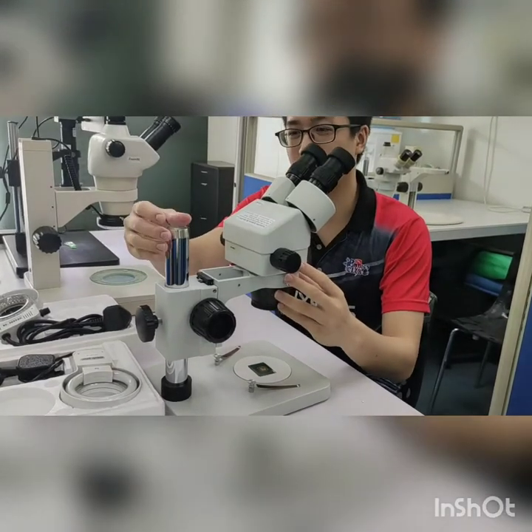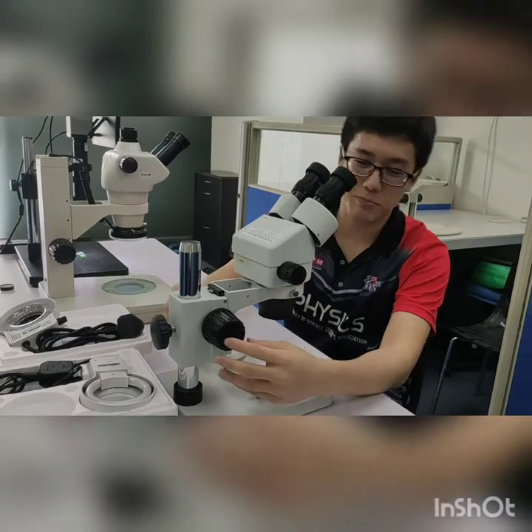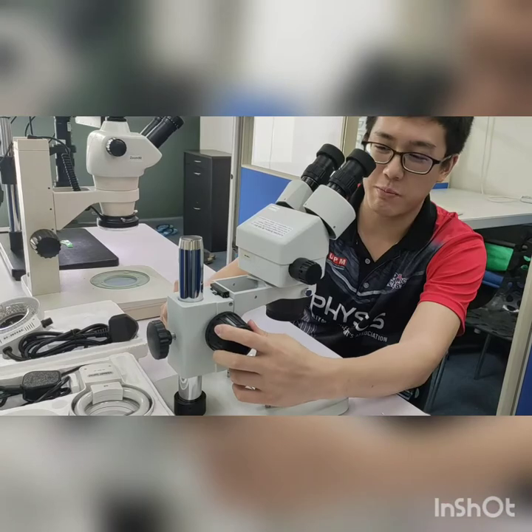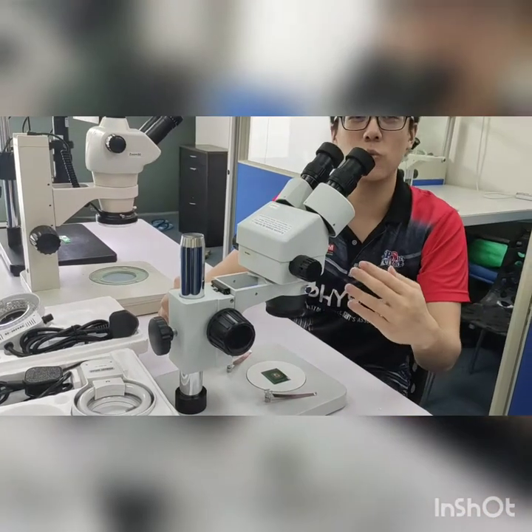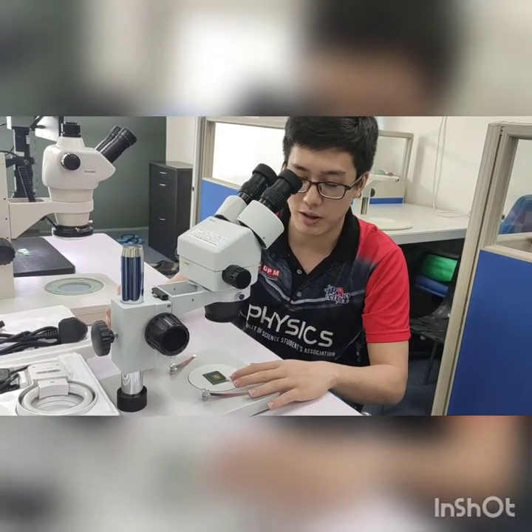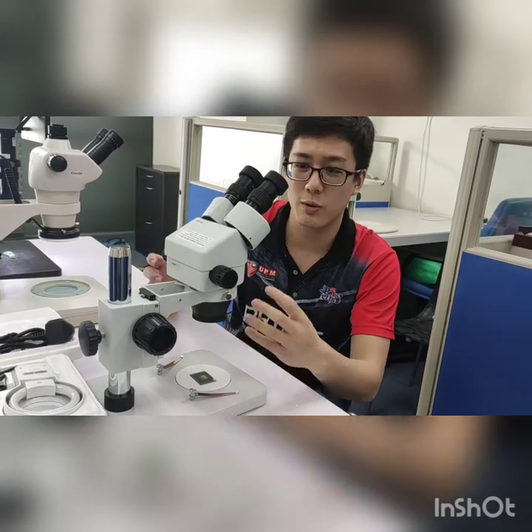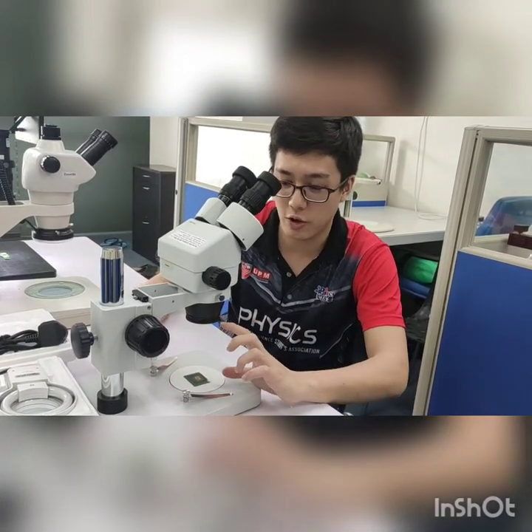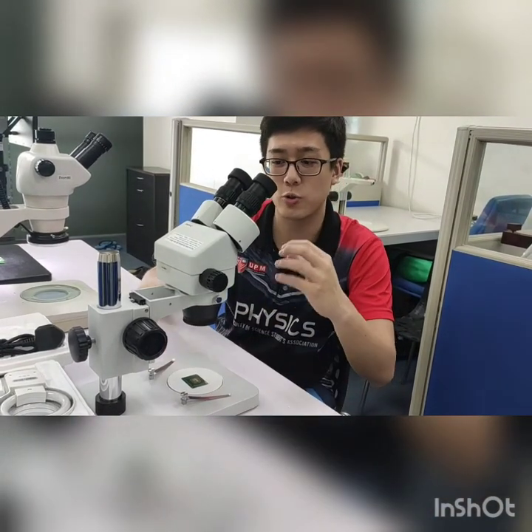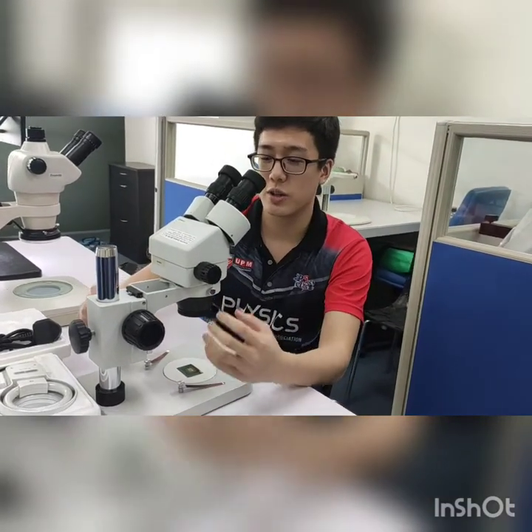Let's look at this part first. This part is what we call a post stand. Next, this part is what we call a focusing knob. The focusing knob is very important because every microscope has its own working distance. Working distance means the distance from the objective lens to our specimen. For example, if a microscope's working distance is 100 mm, then the distance from the objective lens to our specimen has to be exactly 100 mm so that the image can be focused and clear. So this is very important.